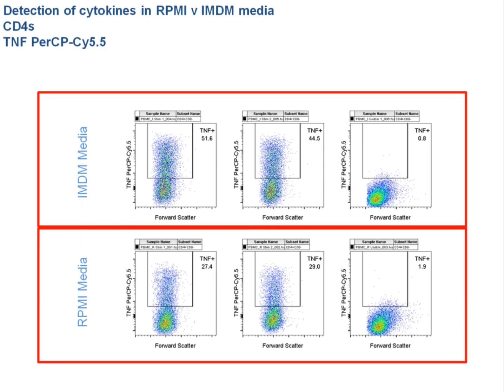Yeah, well, it's in some ways a kind of how long is a piece of string. The more cells you start with, the more robust your statistics. I guess I would say as many as possible. But I've certainly had tissue samples, and again working with studying gamma delta cells, where they're a lot less expressed maybe than CD4s or CD8s, and I may just have a few hundred cells to work with.